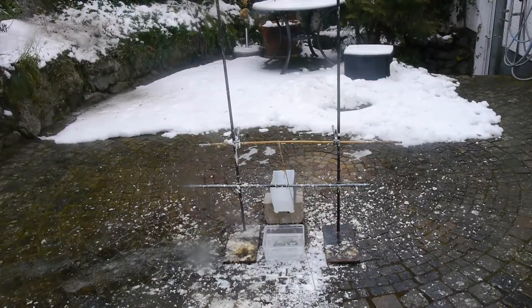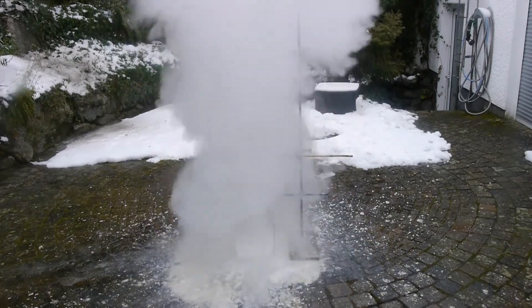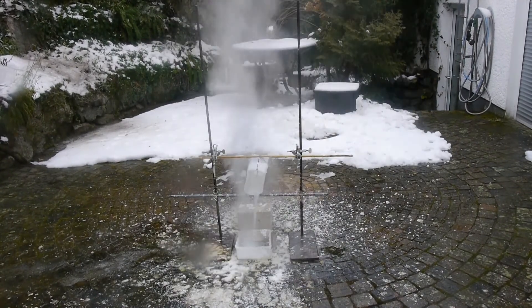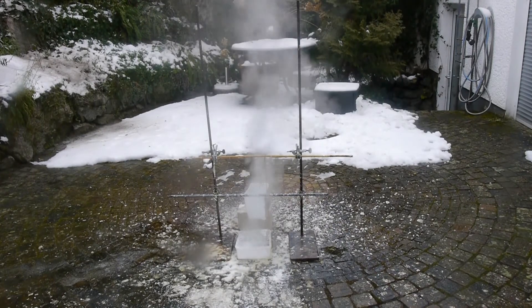Now for the ultimate reaction: concentrated sodium hydroxide solution versus 96% sulfuric acid. That was insane.